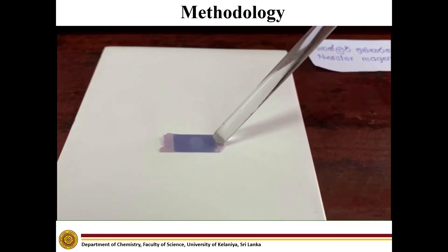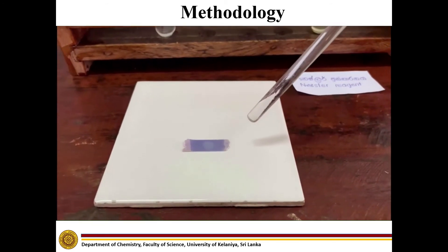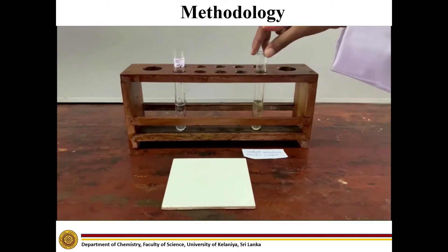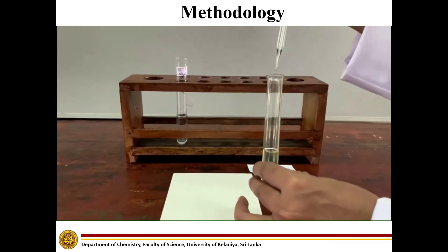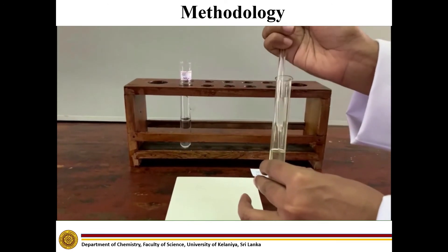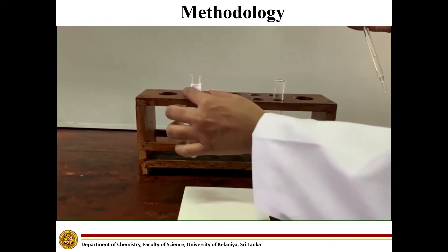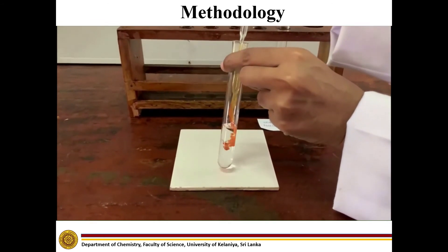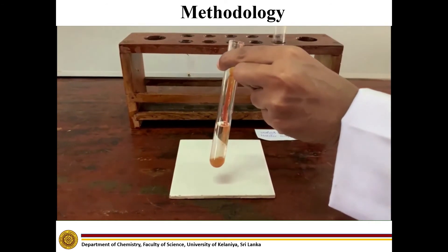It turns red litmus into blue. Brown color precipitation is observed with the Nessler reagent.